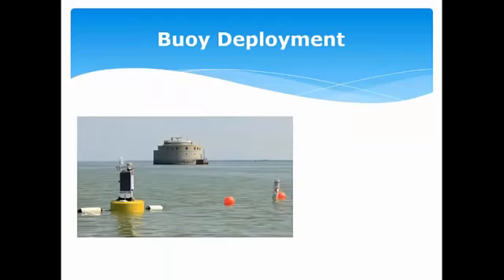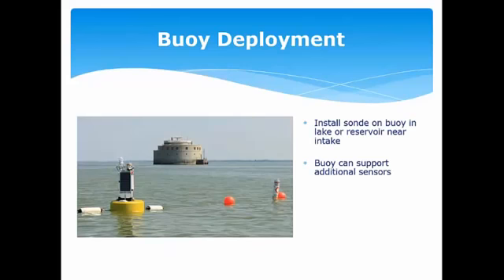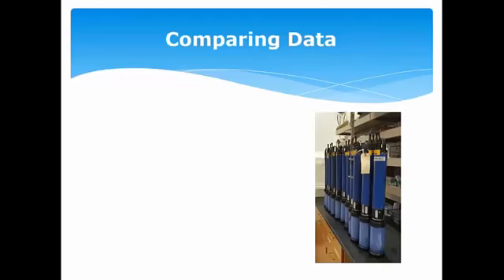This here is a photo of the buoy deployment at the City of Toledo's intake. One advantage of having a buoy deployment is it can support multiple additional sensors: weather station, current meter, webcam, wave sensor, thermistor string to get a full temperature profile, and any other sensor that would be compatible. As Brenda mentioned, this buoy was delivered within, I think, 6 days. We worked with LimnoTech to supply that buoy, get all the equipment integrated, and then LimnoTech was able to deploy that in very short order.